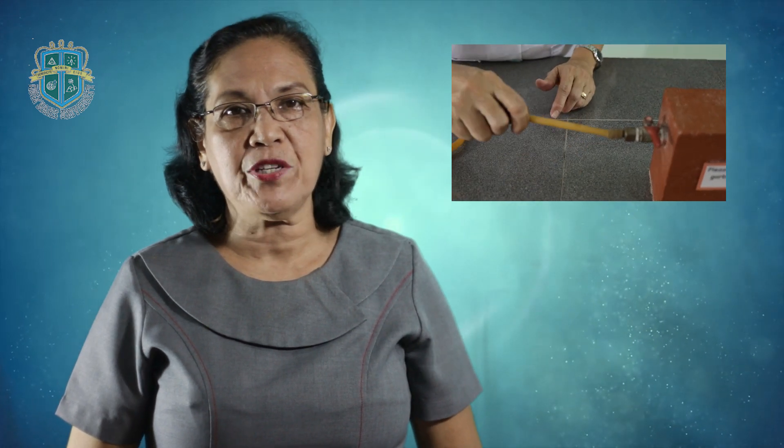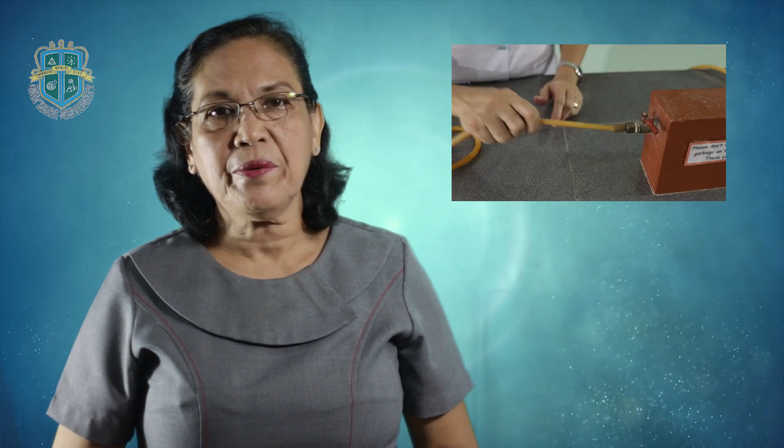Test by pulling the rubber tubing and see to it that it will not be dislodged from the gas cock. If it is already properly fitted onto the gas cock, then the Bunsen burner is now ready to be ignited.